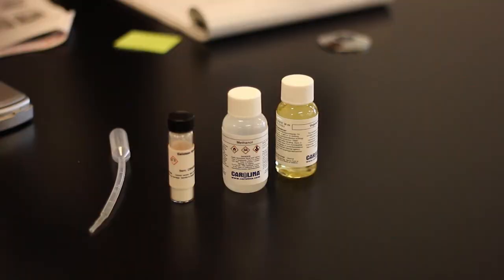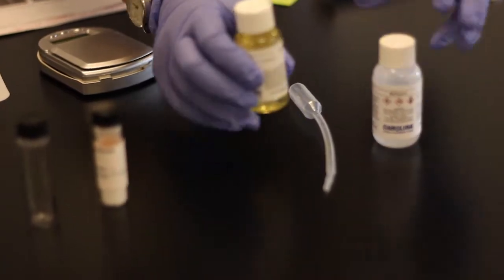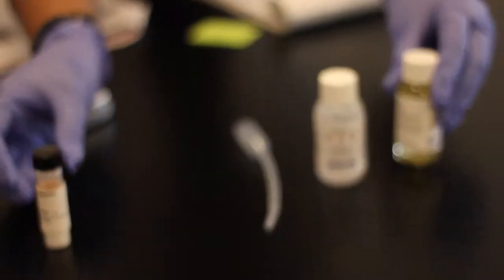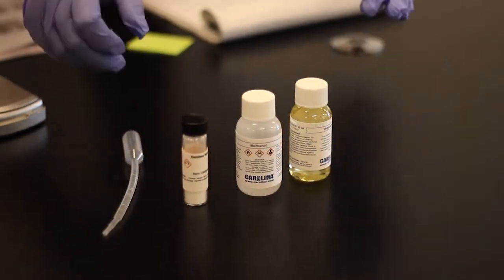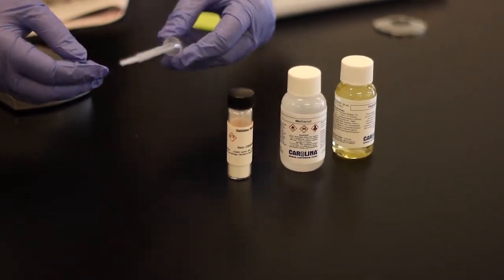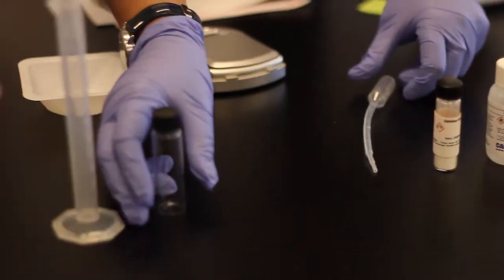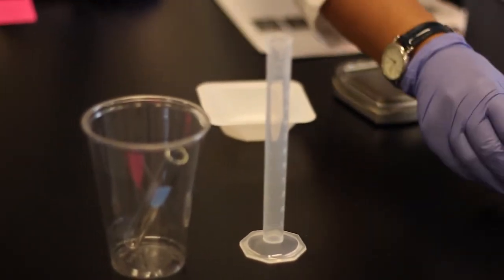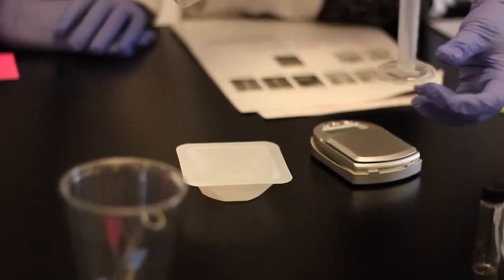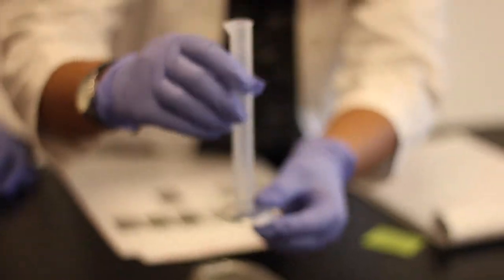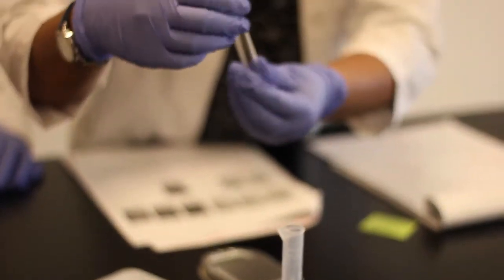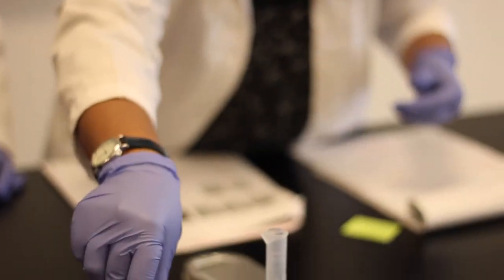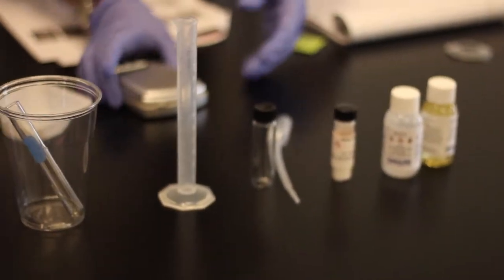So here you have the reactants: methanol, the vegetable oil, and calcium hydroxide. To do the lab, we need a dropper to take some of the vegetable oil, a glass vial, and to measure out the methanol, we need the graduated cylinder. And to do the reaction, we need a glass test tube. So all of these items come in your kit.